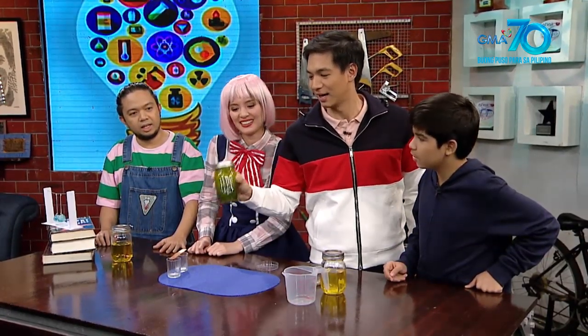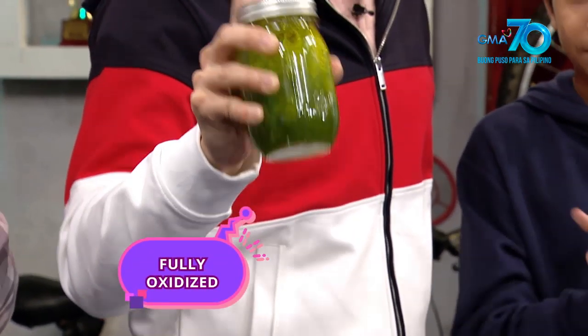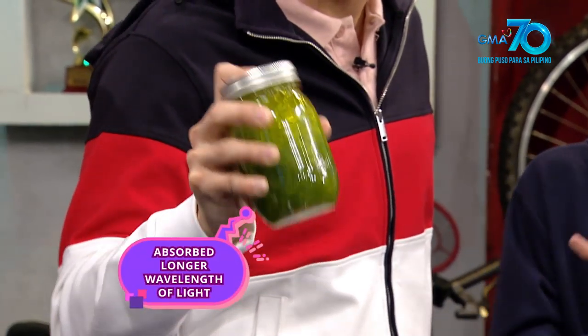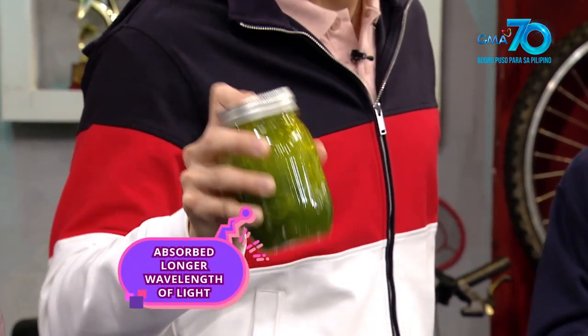Nung hinalo ulit ang solusyon, naging fully oxidized na ang indigo carmine. Naabsorb ang longer wavelengths of light gaya ng pula kaya nagkulay green ito — I believe.